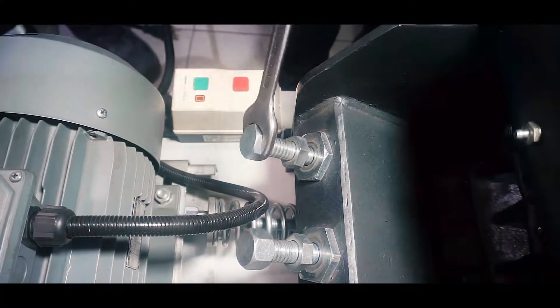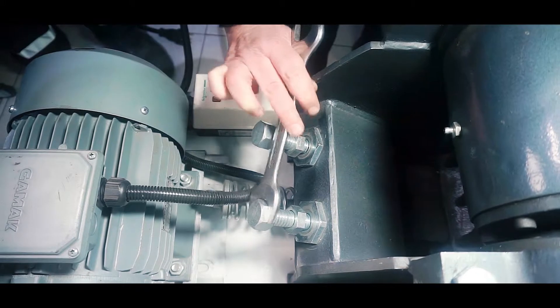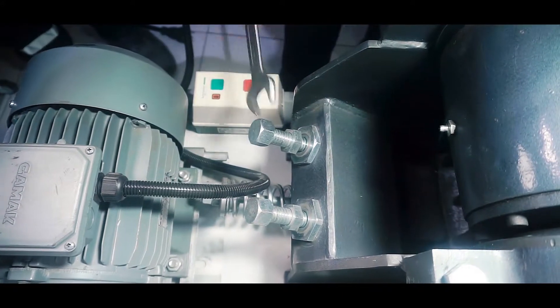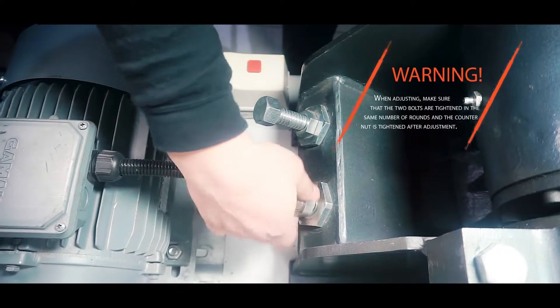With the help of the adjustment bolts on the back of the machine, we adjust the output grain size of the material to be broken and the distance between the jaws before starting. When adjusting, make sure that the two bolts are tightened in the same number of rounds and the counter nut is tightened after adjustment.